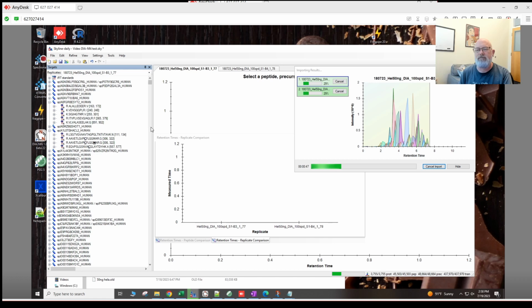Okay. Almost done. Now, the only thing I'm unclear of is whether this keeps the peak boundaries from DIA-NN or makes its own peak boundaries from the spectral library. That I'm not sure.